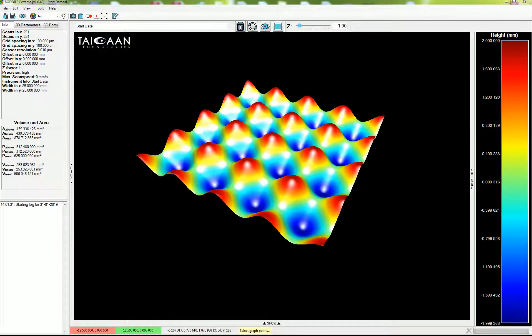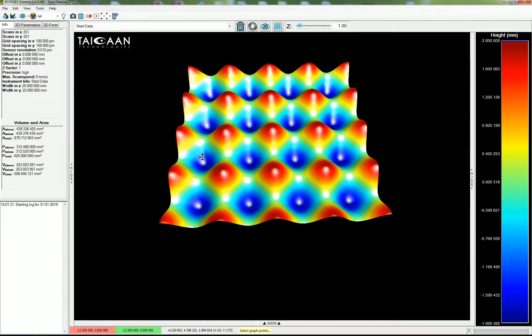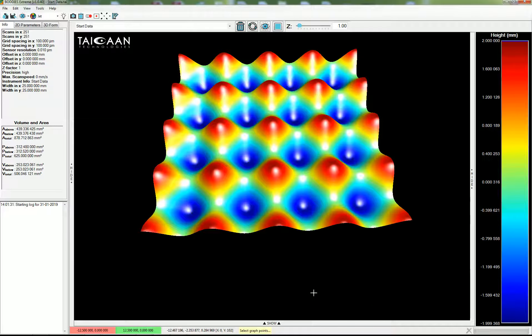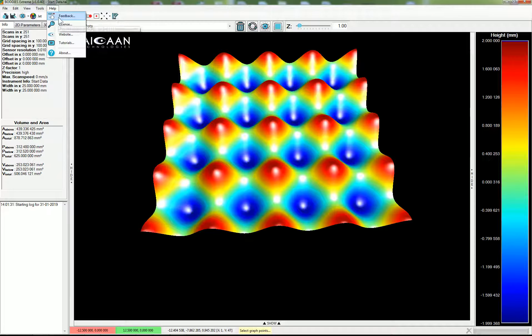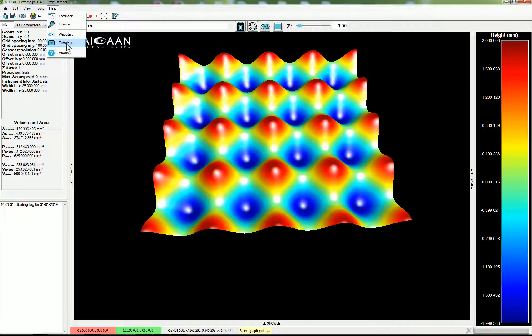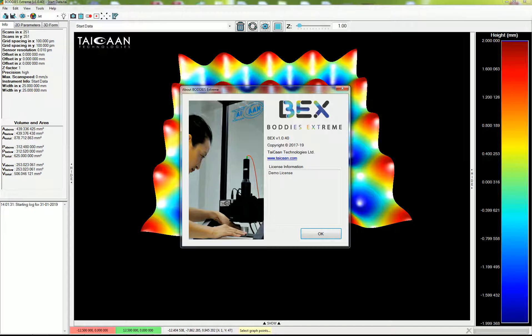Looking at the image in front of you, you can see a default dataset that's been loaded when we open the software — I'm rotating it and can zoom in and zoom out. Before we look at the detail of the screen, let's go to the help button on the top left. Clicking that shows options: feedback from the customer, license information, a link to the website, and a link to these YouTube tutorials for instant tutorial access. And finally, clicking 'About' shows the BEX logo — this is a demo license for the purpose of this demonstration.